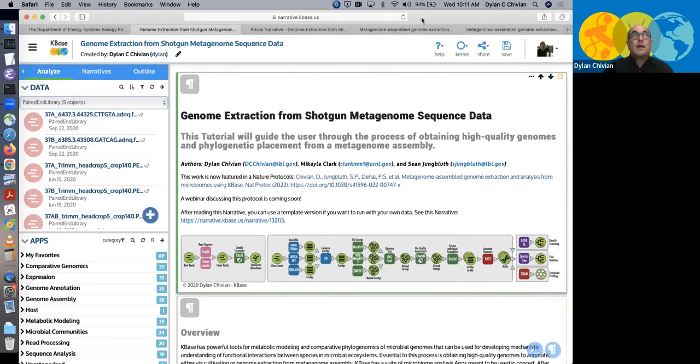If you do the same amount of sequencing, but do it across these different conditions, these varying enrichments, you're going to get significantly better results, because in one of these conditions you're going to have certain lineages come up, and in another one you're going to have others come up. And so you'll get reads from each of those that you wouldn't have gotten otherwise necessarily.